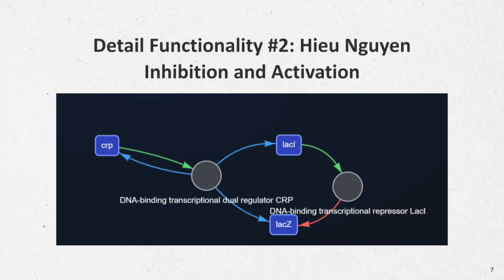In the case that the gene does not exist in the EcoCyc database, we would then search for that gene inside of UniProt as a backup, just so that we can show the user any information that would be relevant.